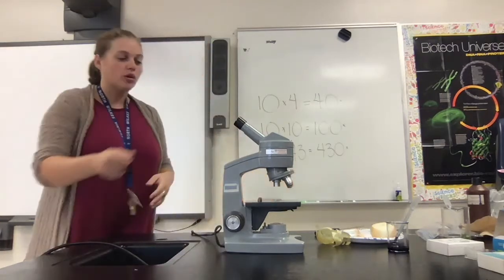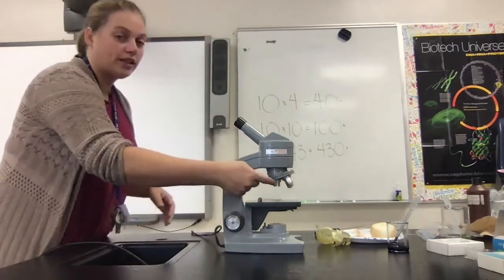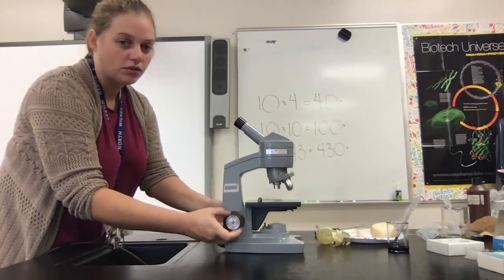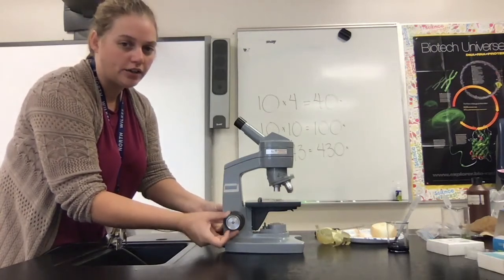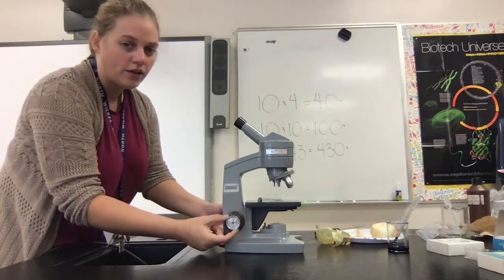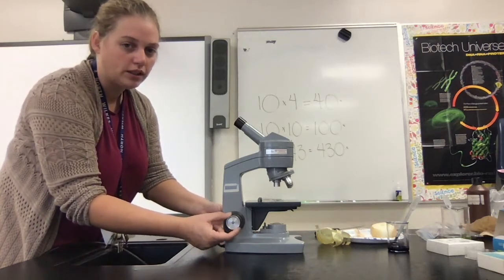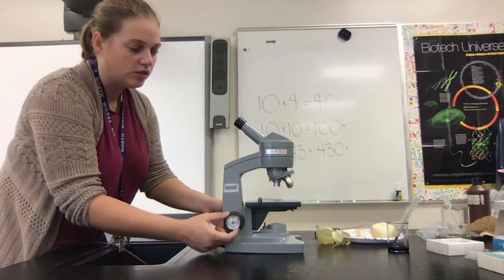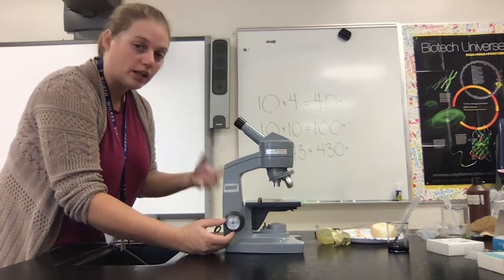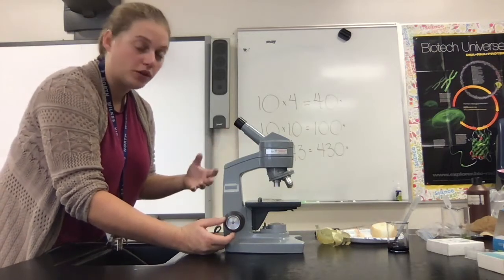So once we have our specimen under the microscope, we're going to have our lowest objective set, and we're going to use these 2 knobs. The big knob is your coarse focus, and it's big and gray, and you're going to notice that it'll actually move the objectives up and down. We have another knob, which is this little silver one, and this is the fine focus. And this is going to move around the lens in the eyepiece so that we can get our specimen focused.